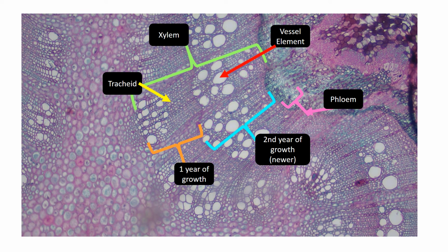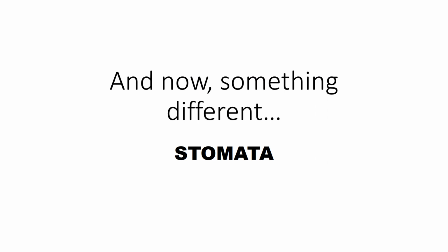There's also one other thing we looked at I want to touch upon, and that is the stomata. And so the stomata connects with the vascular tissue in a way, in that the vascular tissue carries water through the plant. And then one of the main drivers of water movement in the plant is the stomata, because of something called transpiration, which we probably talked about at this point.